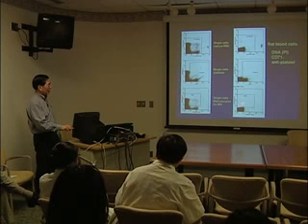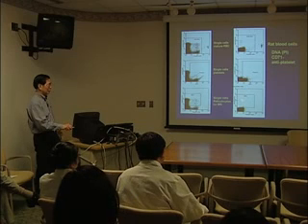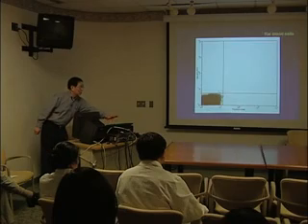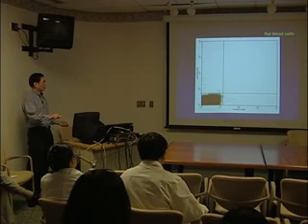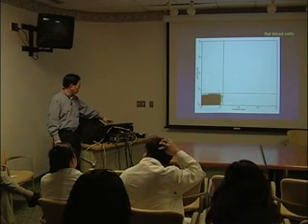And you do a final gating of just the reticulocyte with the reticulocyte marker, which we don't have anything, but without the platelet. So the final product of that red blood cell, you see that everything is sort of housing in this double negative area. You don't have much of the DNA content at all because you already eliminated them, and you're not supposed to have any micronuclei. And you get few spots. Like I said, this could be your total background.